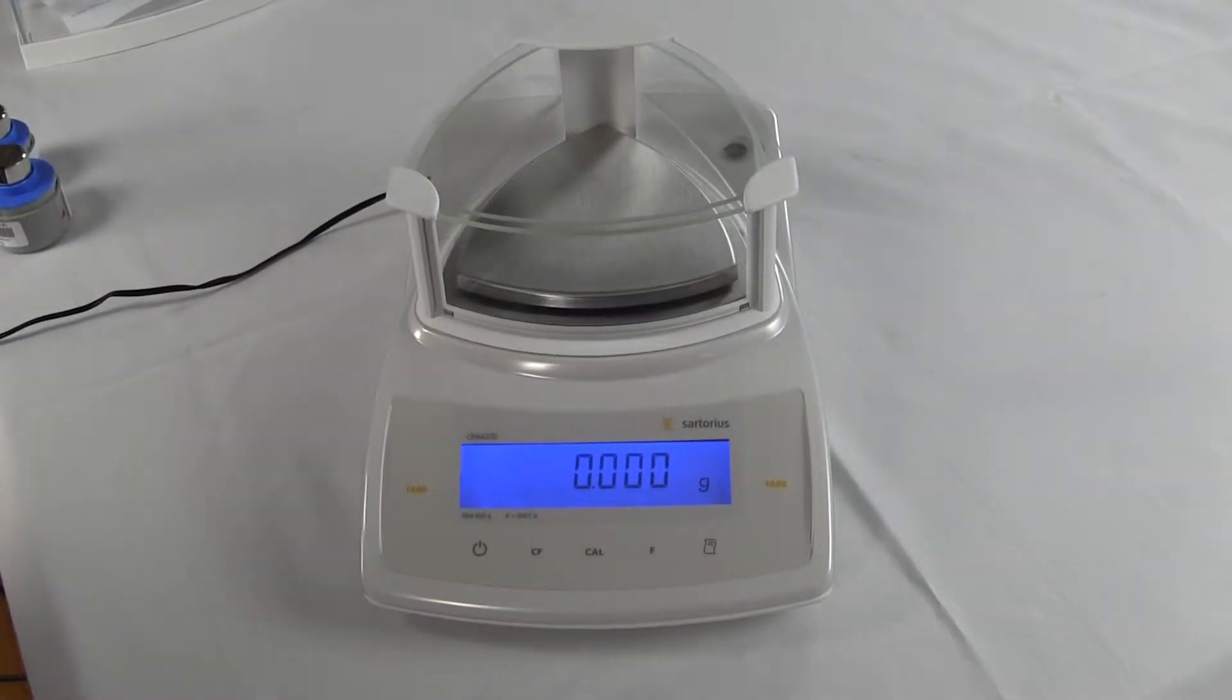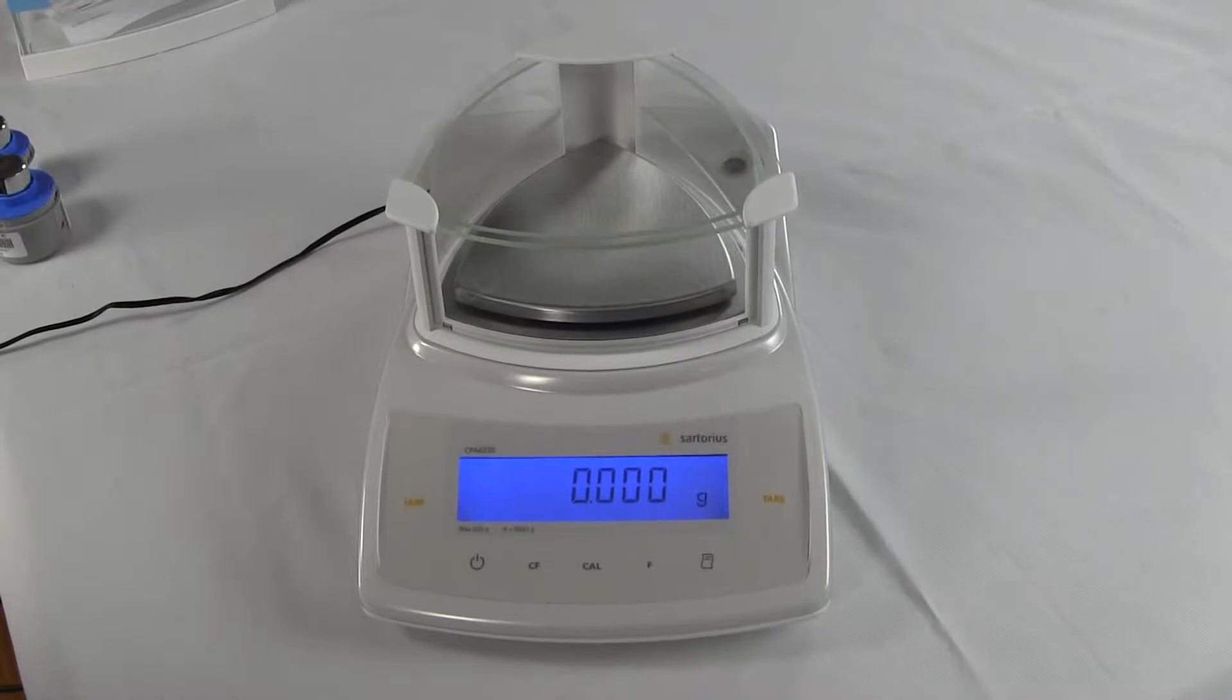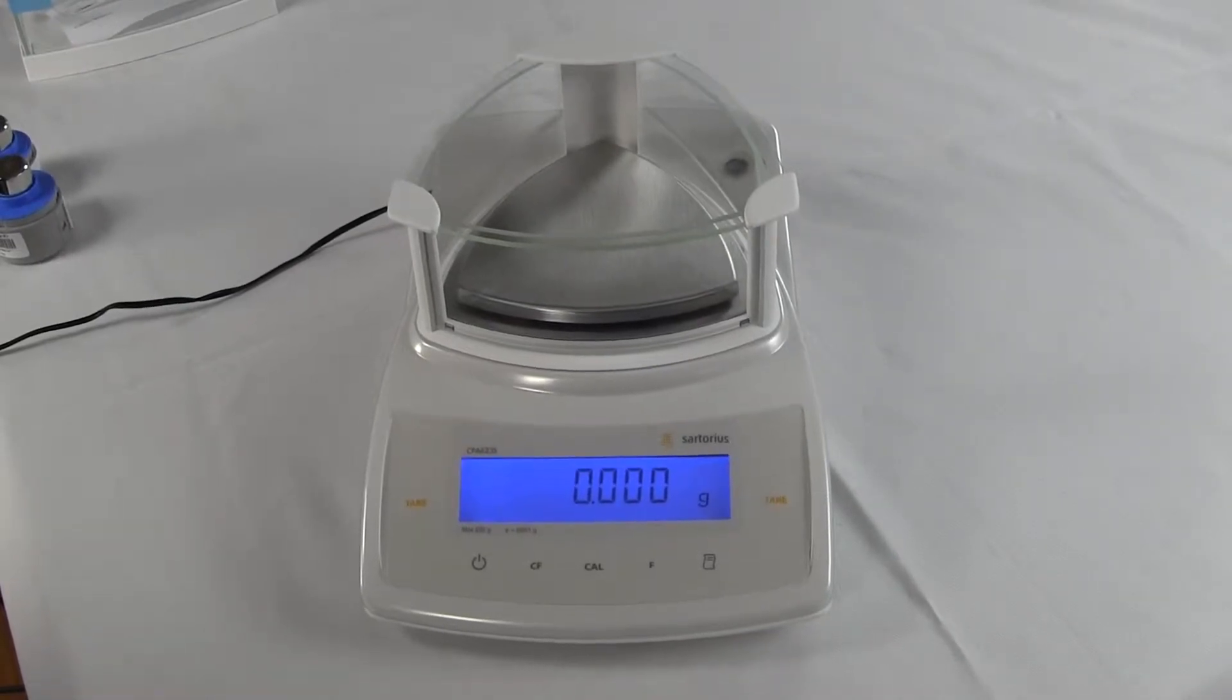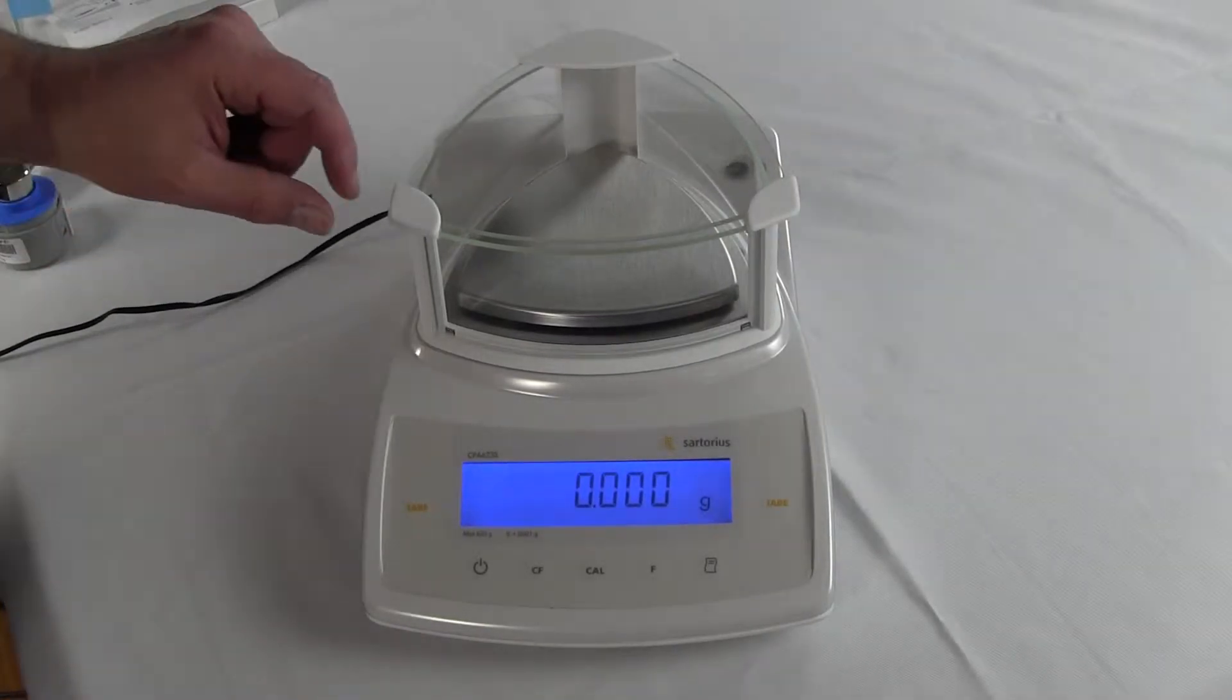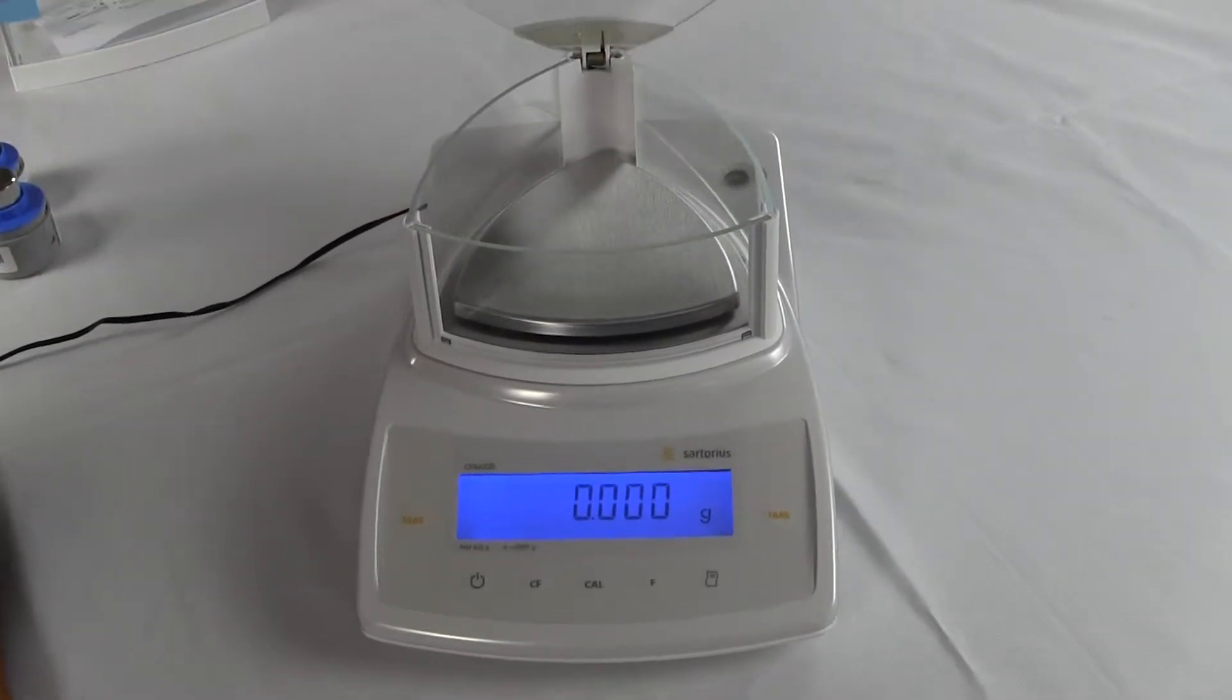Welcome to Precision Weighing Balances. Today we'd like to show you the Sartorius CPA 623 milligram balance. This balance comes with a three-year limited manufacturer's warranty.